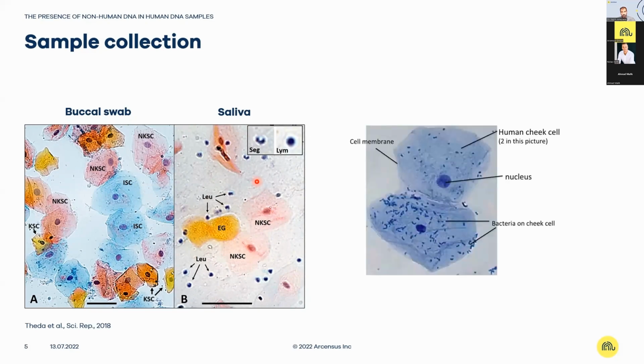However, for some samples, besides these large cells with the core that contains the DNA in the middle, we often also identify the presence of bacteria, which is depicted here in these very tiny rod-shaped dark particles that we see all over here. So this may be an example of an exaggerated sample that has a lot of bacteria in it. And nevertheless, it can happen that samples may contain this kind of bacteria.